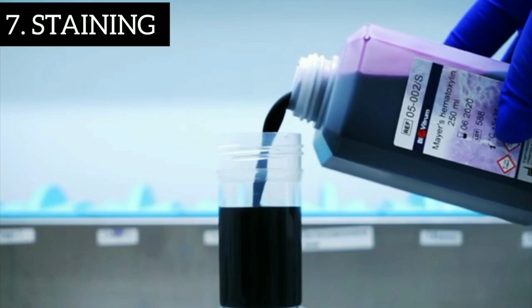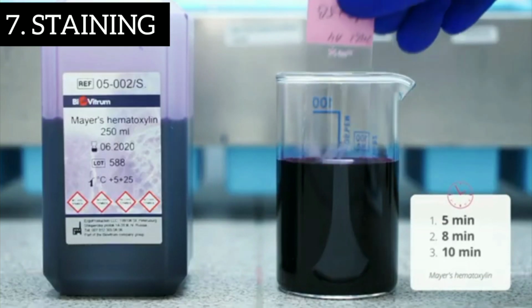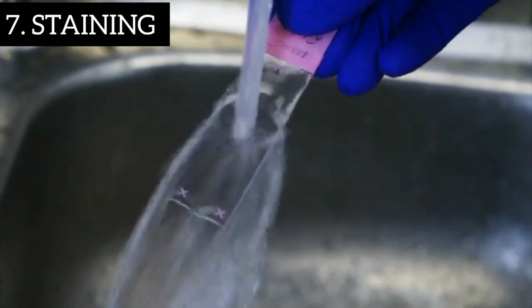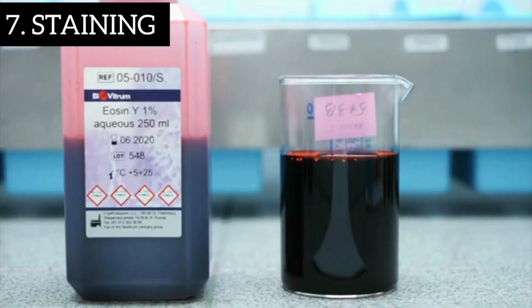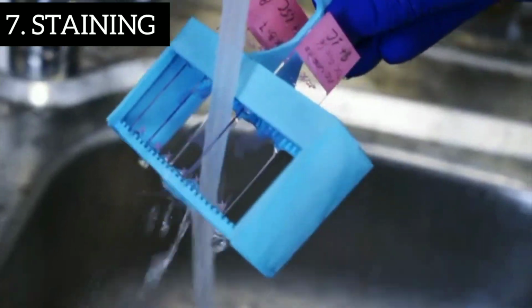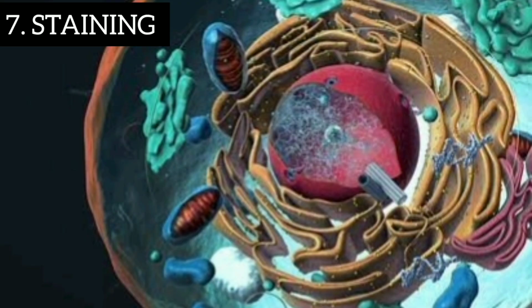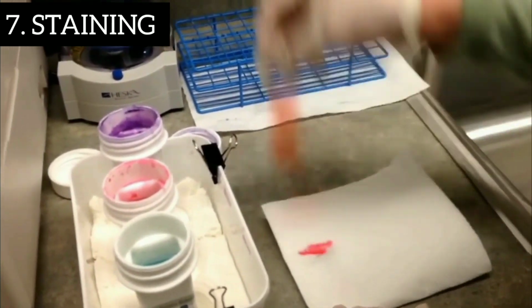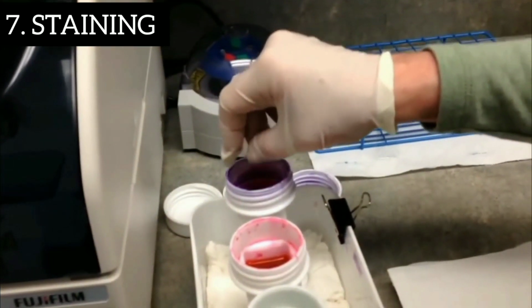The most common staining method used in histopathology laboratory is the hematoxylin and eosin method. This method is used as a routine staining technique as it can easily color the cytoplasm, nucleus, and organelles. Other stains may be used if specific cellular structures or specific organisms must be stained.